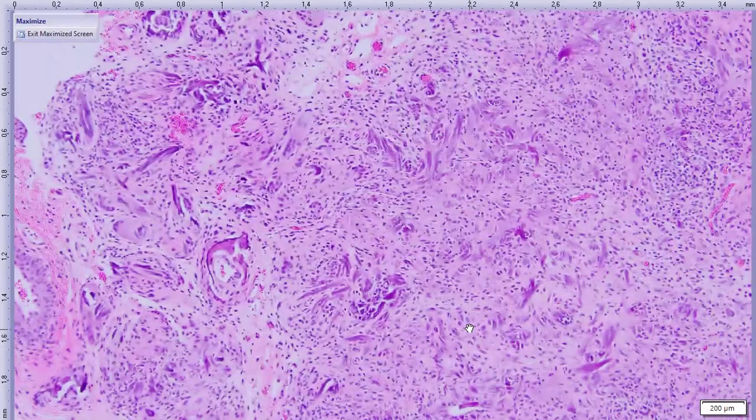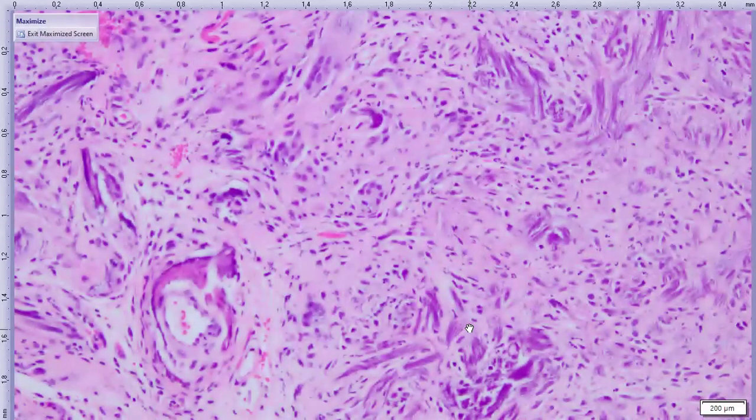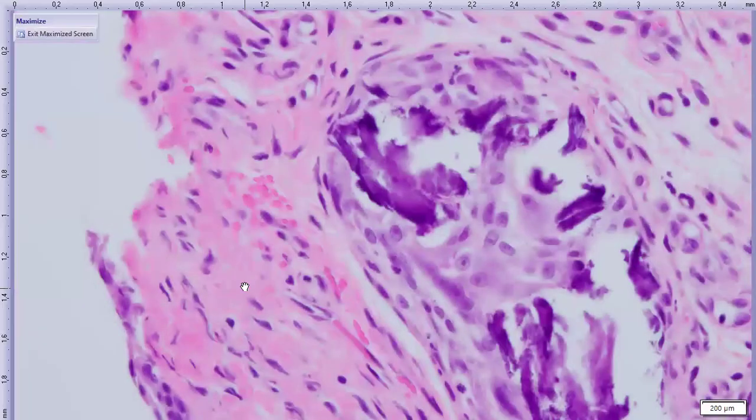And when we go to higher magnification, we see a lot of that basophilic material. And actually, there are two different flavors, I thought, in this sample, and by flavors, I mean morphology. So here we have sort of basophilic, chunky, irregular, crystalline material. You can see how it's kind of shattering as it's getting sectioned, or it was shattered as it was sectioned.